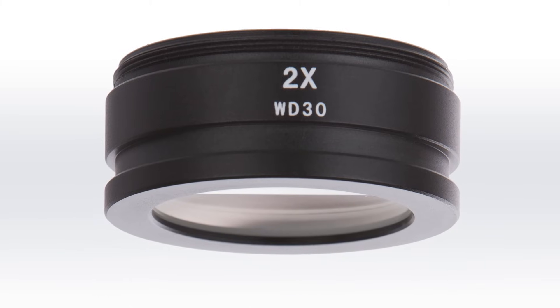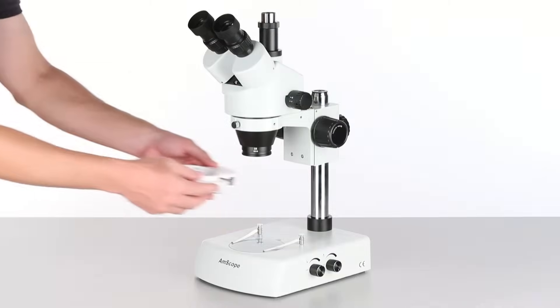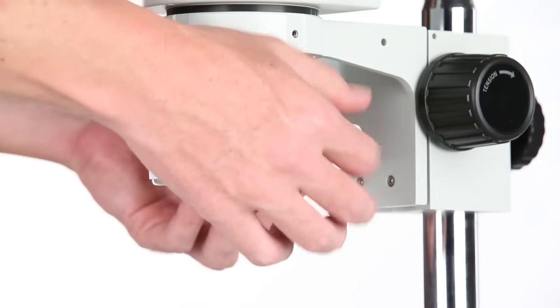The 2x Barlow lens has a mounting groove, which allows the ring light to be mounted directly.